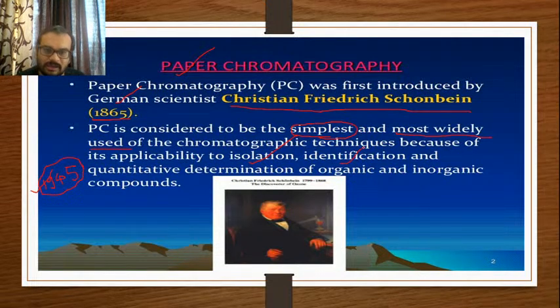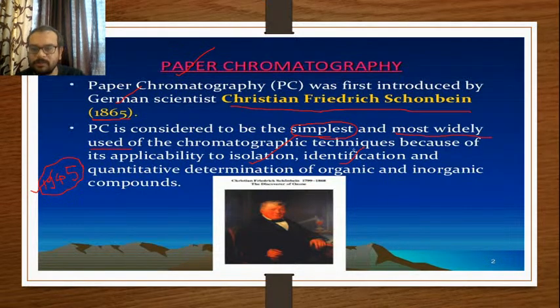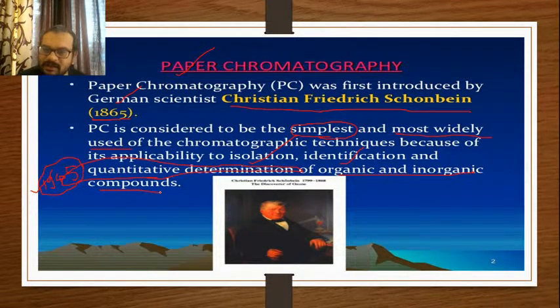Remember, isolation and identification can also be possible in the case of paper chromatography and HPLC. It can be helpful in the quantitative determination of organic as well as inorganic compounds. That means it has both qualitative and quantitative applications.